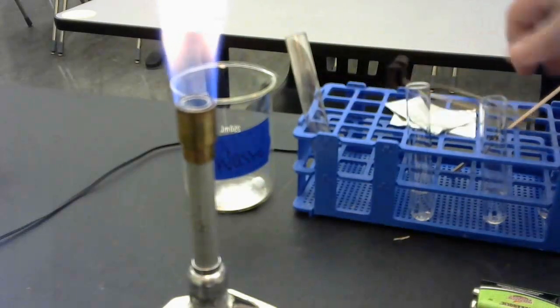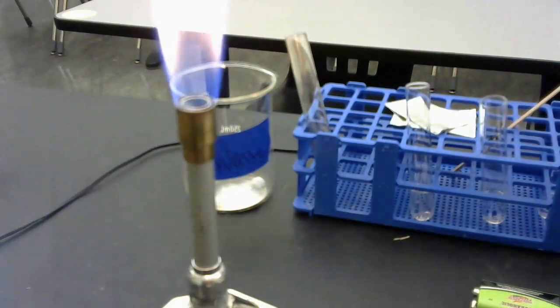Then make sure that you write your observations, that you balance your reaction, and that you write the word equation there. So sodium bicarbonate, or sodium hydrogen carbonate, is going to decompose. It's going to break down. What does it break down into? Balance the reaction and name the components of that, okay?